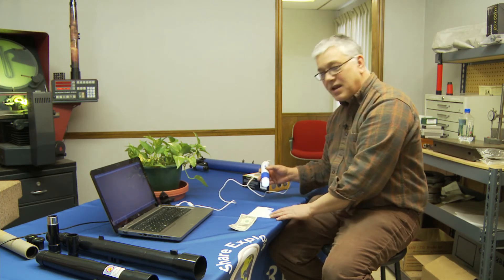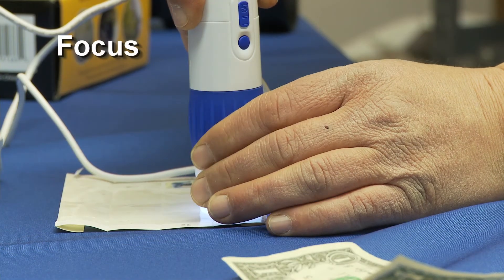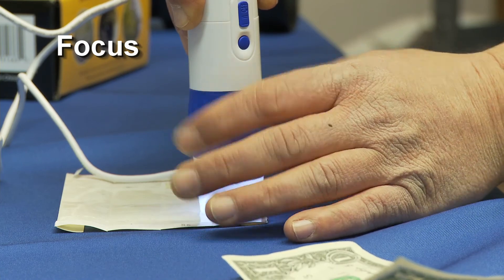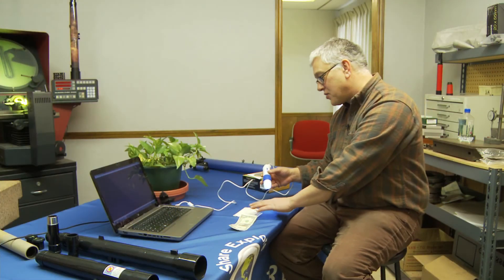I've also borrowed some stamps here and I'm just going to set it down on a stamp. One of the things I noticed about the stamps is when I went to see the letters and numbers on the stamps, I actually couldn't see this with my eye. But you'll notice that it says 2007 down there in the corner. So that's kind of cool.